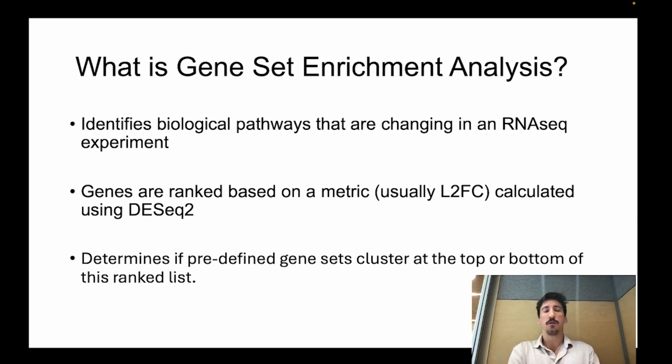So first, you may be asking, what is Gene Set Enrichment Analysis? Gene Set Enrichment Analysis is a method that helps us understand which biological pathways or gene sets are changing in an RNA sequencing experiment. This is in comparison to just focusing on individual genes.